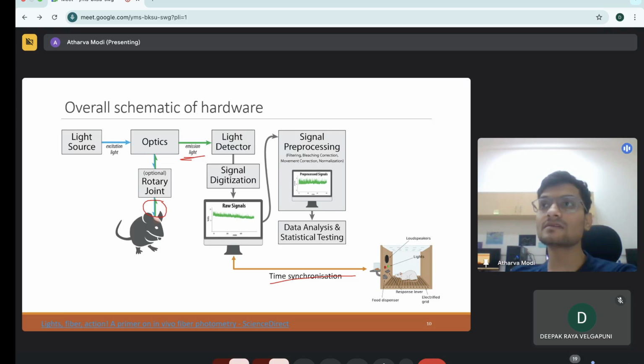Are rats the typical model system for this technique, or could you use smaller organisms? So we can use rats, mice. People do this kind of technique in in vitro cells also. You can do it in brain slices also.